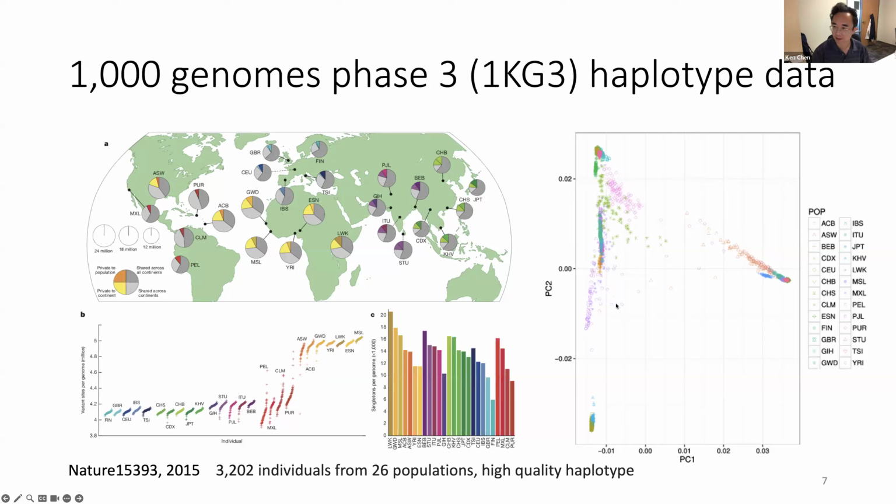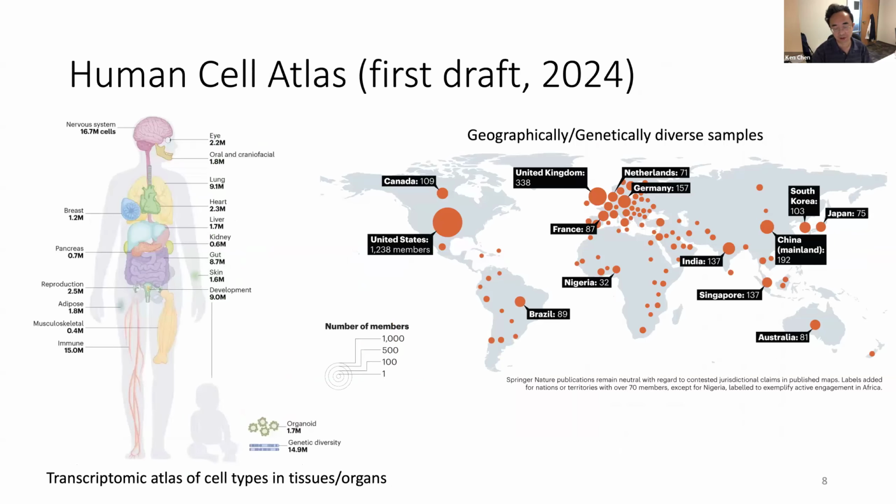So this is one of our reference population genetics databases, and it is also being used in the Monopogen work. Nowadays, I think the reference idea has been expanded to the transcriptomics level. For example, the Human Cell Atlas now has the characteristic transcriptomics of different cell types across 18 different organs, which, as you know, people have tried to model with different types of foundation models.